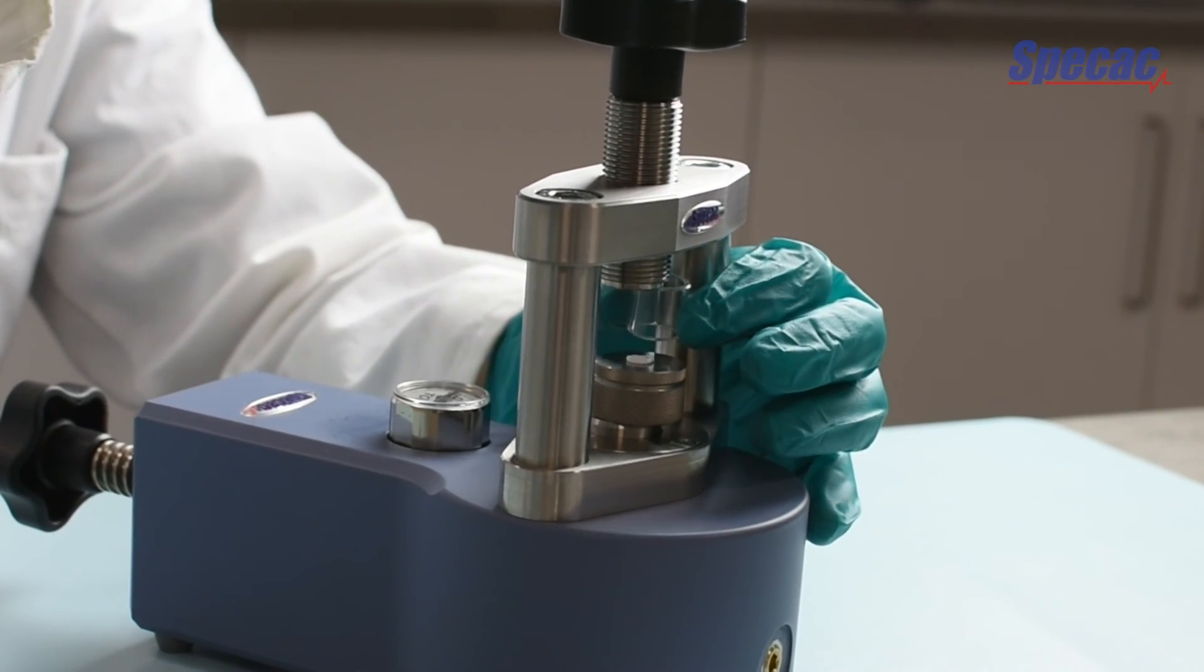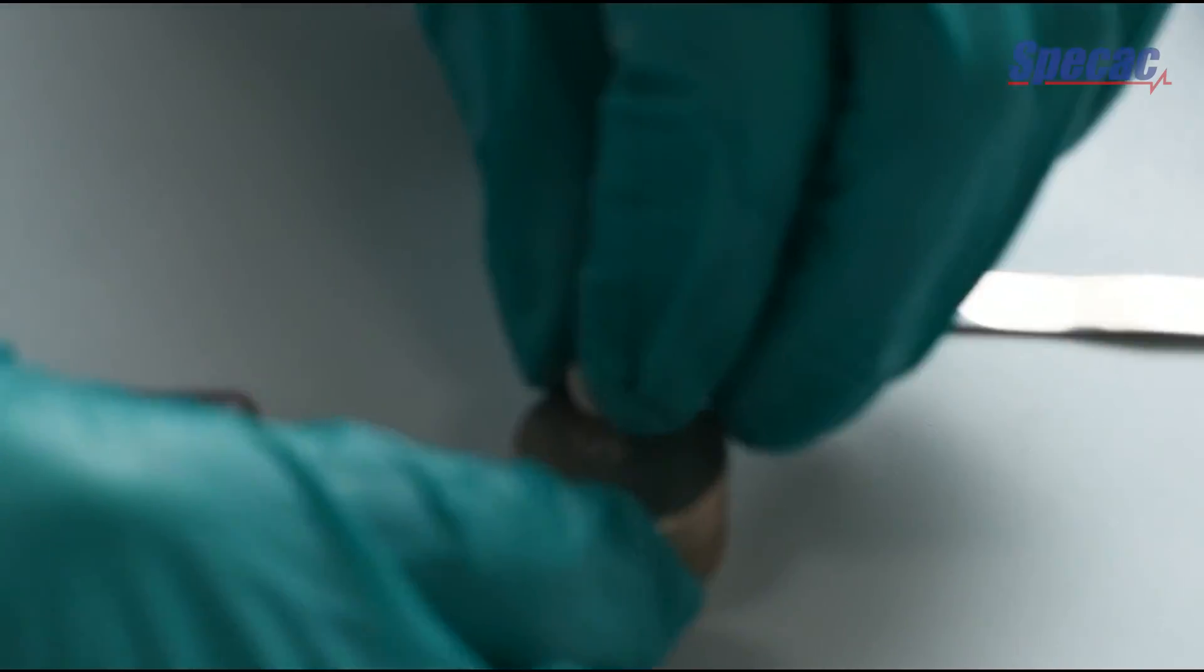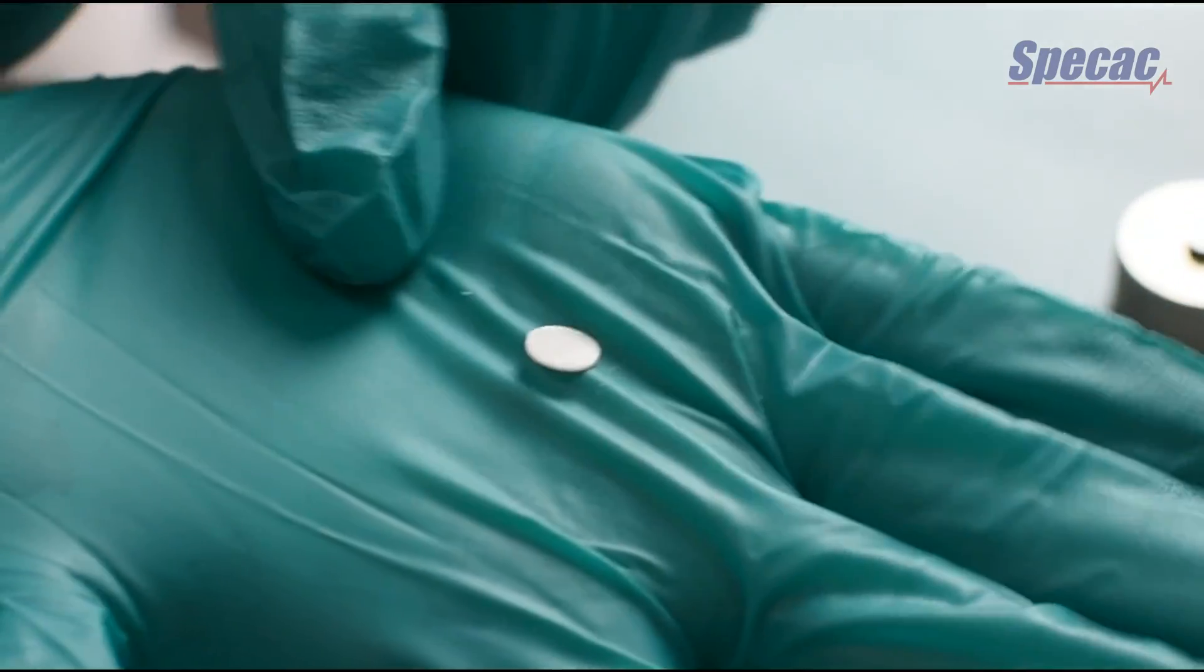The intact KBR pellets can now be saved or used for any further purpose and the ring die holder and anvil parts can be cleaned ready to be used again for the next KBR sample pressing.